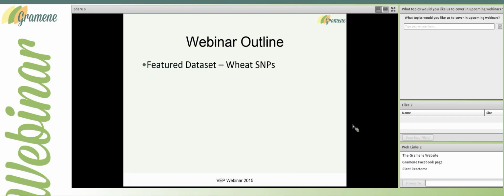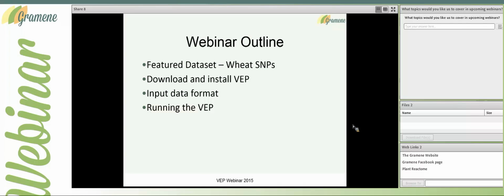Now during today's webinar we will cover the featured data set, which are SNPs that come from wheat. We will learn how to download and install the Variant Effect Predictor. We will look at what type of input data that you will need to run the Variant Effect Predictor. And we will also learn how to run the Variant Effect Predictor on the command line.